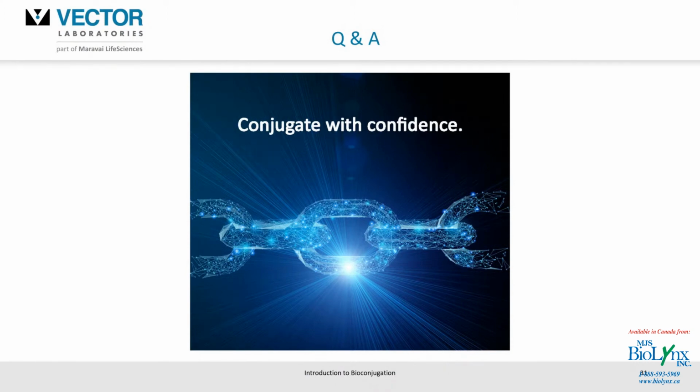The next question is about siRNA antibody conjugates. Can you elaborate on this application, and how do you remove excess siRNA? Fair enough. I did touch on that a little bit with the oligonucleotide kit, where I spoke about targeted oligonucleotide delivery. Maybe you'd have a protein, for example, and what some investigators are looking at with the siRNA is trying to increase its longevity.